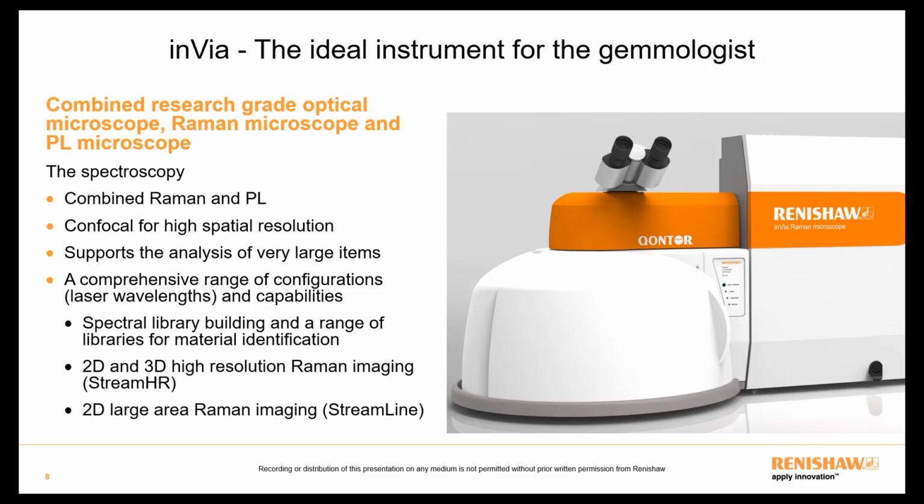Using the MS30 motorized sample stage, we can collect map data from which false color images of the sample are generated. This enables spatial context of different materials, which may be present from any mixture. From the images, distribution and particle sizes can be quantified and compared between samples.